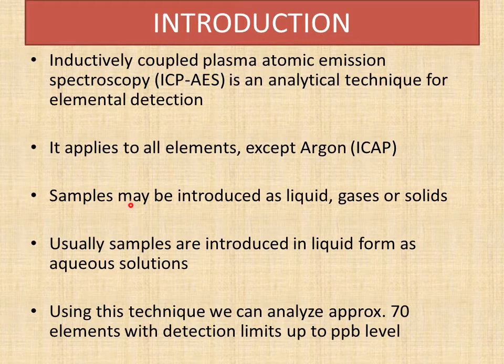Then the sample may be introduced as liquid, gas or solid. So our sample may be in any state, solid, liquid or gas, and definitely we must change the sample introduction system accordingly. Usually samples are introduced in liquid form as solutions. Some organic solvents or aqueous solutions can be introduced in this technique.